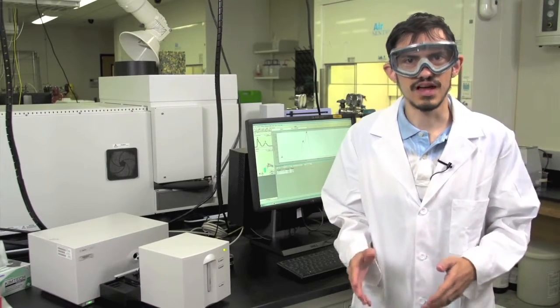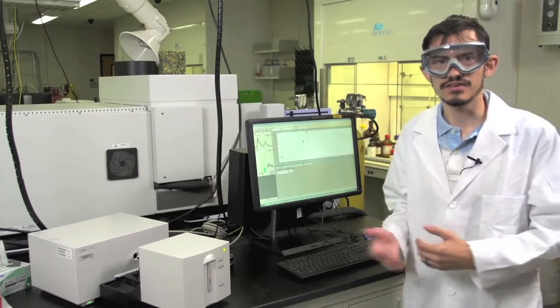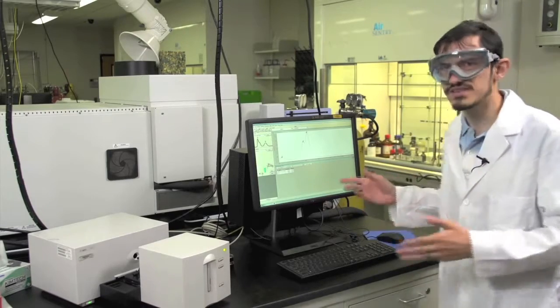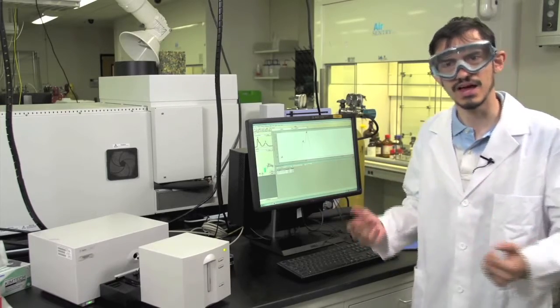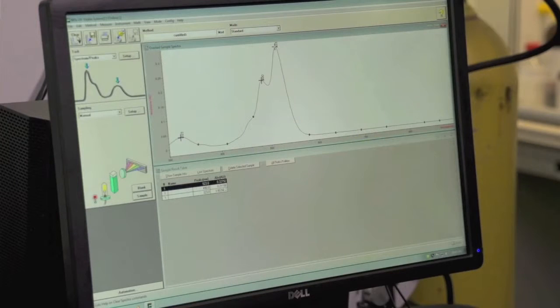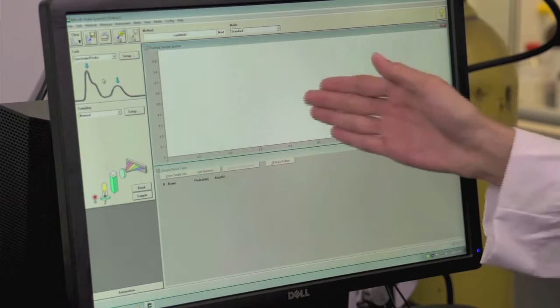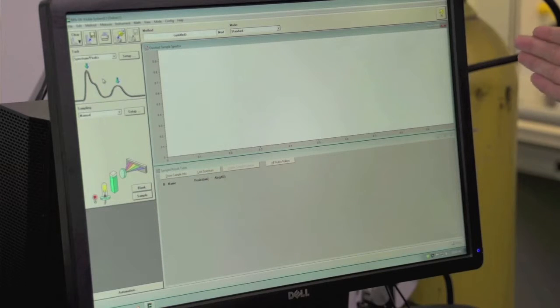Now that you're done with the cyanide dyes portion of the lab, we'll want to clear out the existing spectra on the software. You'll want to do this anytime you're going to be changing settings or transitioning into a new part of a lab or where you don't want spectra that are overlaid. In order to clear the samples, press clear and samples on the software, and you'll notice that the spectral window is completely cleared out.